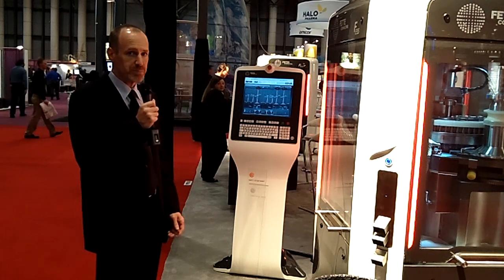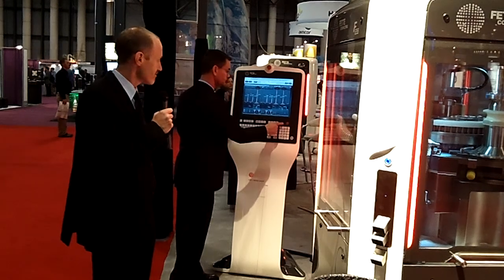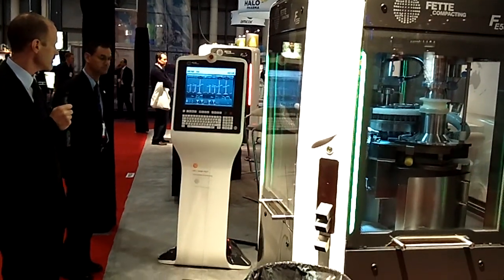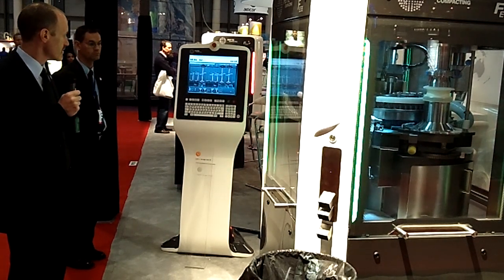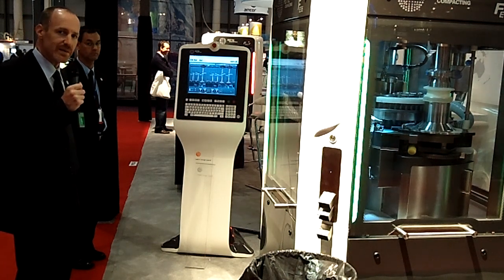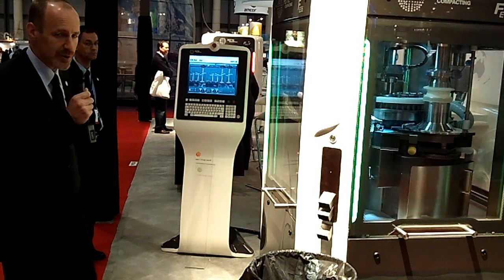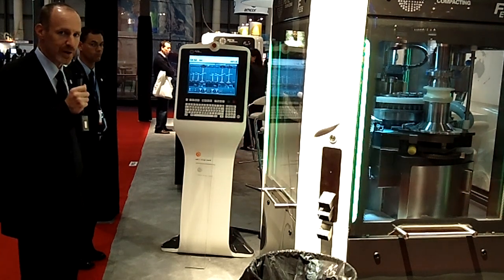So now we'll just put the press into motion for a few moments so that you can see what it does. Thank you very much. For more information, we would invite viewers to visit our website at www.fettecompacting.com. Thank you.